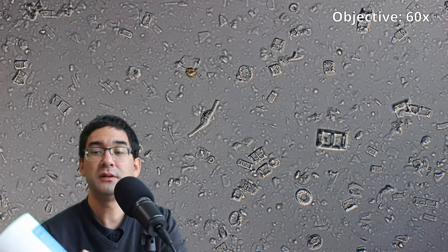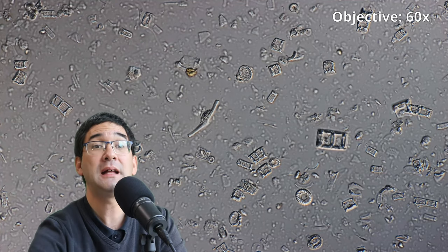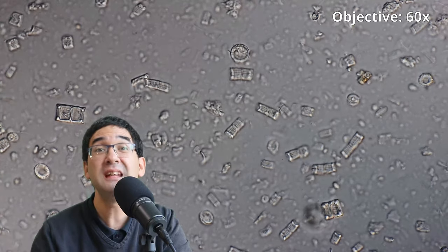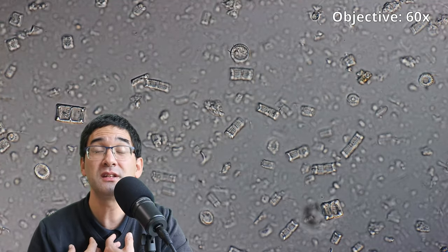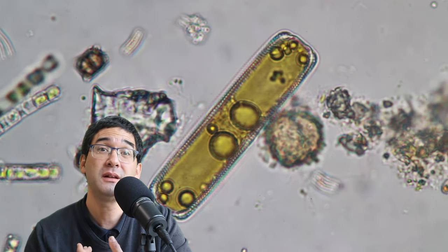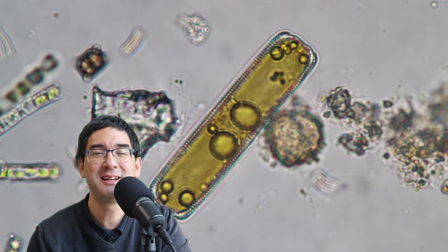Now the container that I bought here, it's sold as a dietary supplement. I personally, I have to tell you, I probably do not want to eat it because silica, you shouldn't inhale it because it's not good for your lungs either. But in any case, it does look nice under the microscope.